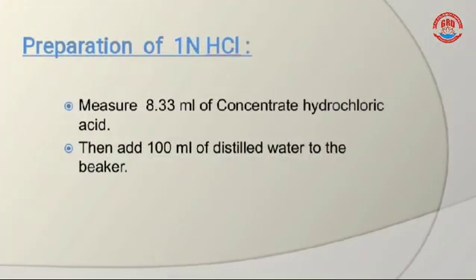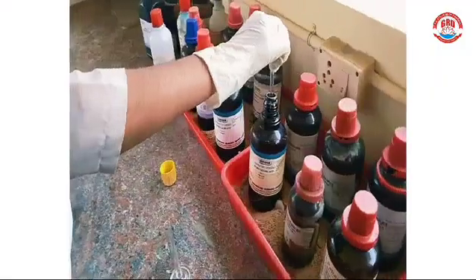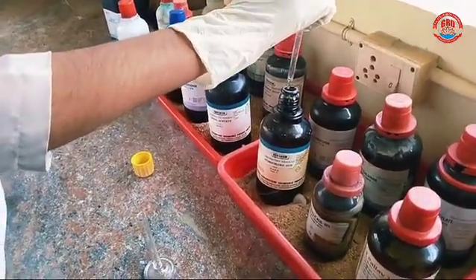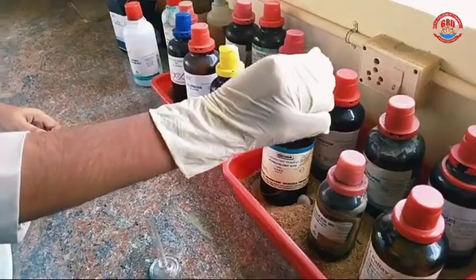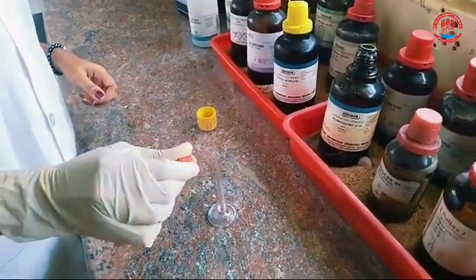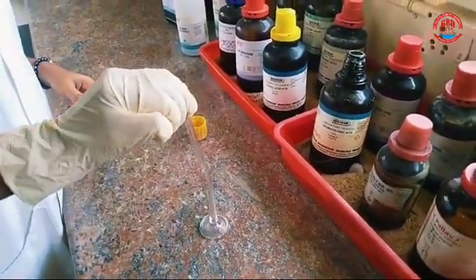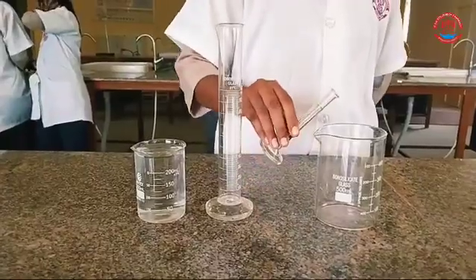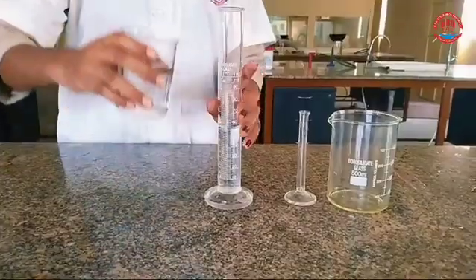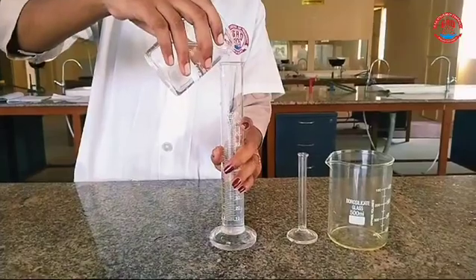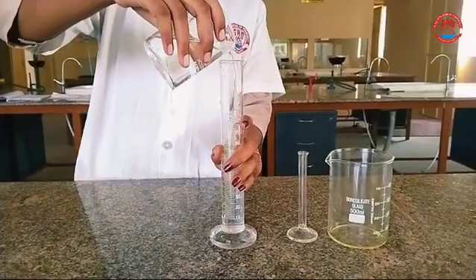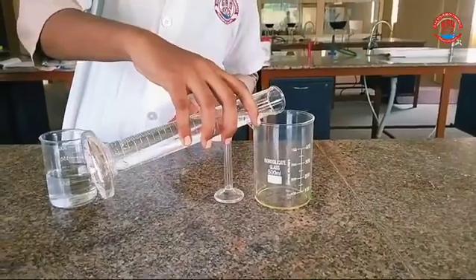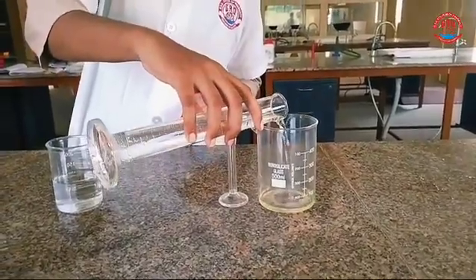Preparation of 1 normality hydrochloric acid: Measure 8.33 ml of concentrated hydrochloric acid, then add 100 ml of distilled water to the beaker.